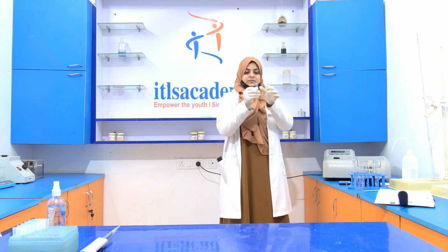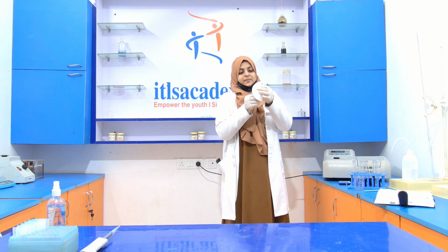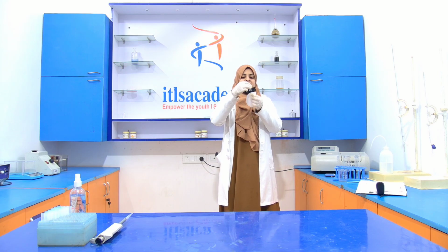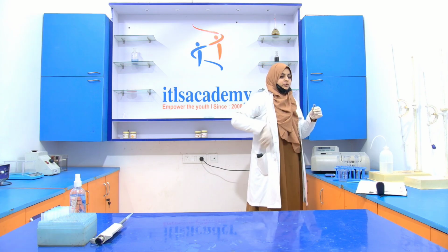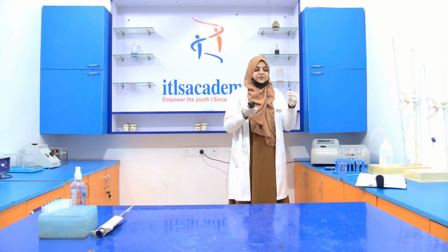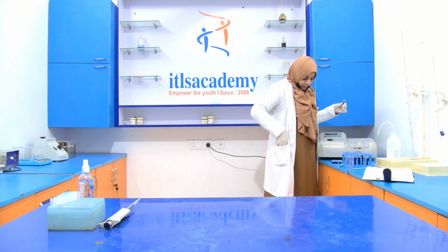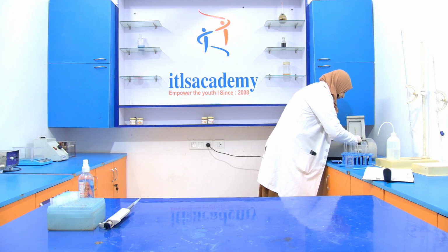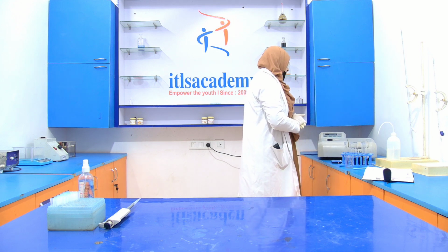Now transfer this into the cuvette and then just dry this cuvette with the help of the filter paper. Just wipe it. And again put this cuvette inside the spectrophotometer and ensure that the opaque side will be in front of you. Simply, now open this spectrophotometer and put it in, and wait for the reading.